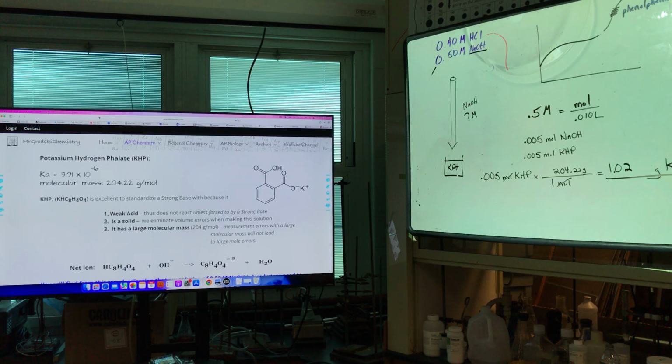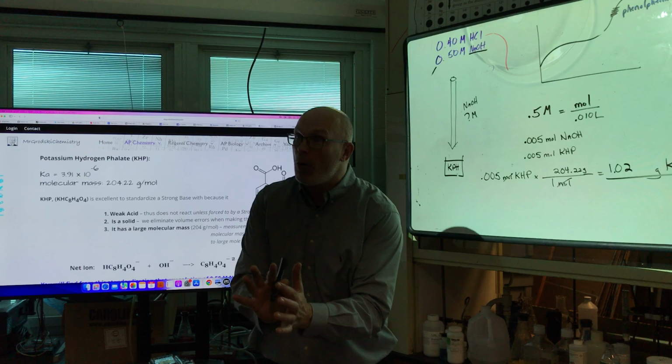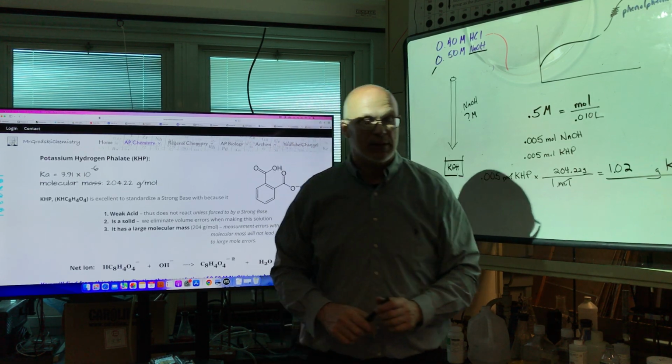All right, so that's the explanation of how to make the solutions and why we standardize. Because my strong base is going to react with everything else. I have to figure out what it is today to know exactly what my tablets are today.